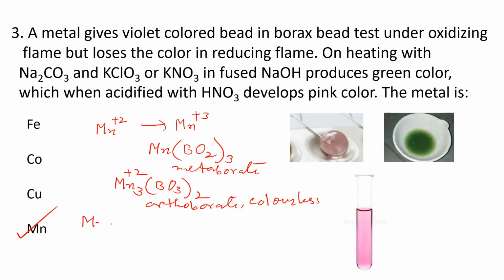This manganese oxide which is formed reacts with either sodium carbonate or sodium hydroxide, any way you can write, and oxygen which comes from potassium chlorate, forming sodium manganate, Na2MnO4, and this is green color.